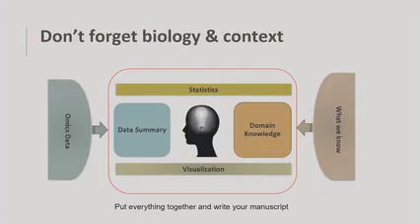This is something I always want to show in my presentation: you are at the center, you are the master, you are the driver. We develop tools to help you, and we don't give you a final answer, it's for you to decide. Also, stats are not the final say. If the p-value is not significant, it doesn't mean my result is not useful. No, it's not about that. It's really about your understanding of the data and your design, and how it compares with the literature. So your brain needs to work actively. That's the enjoyment of research.